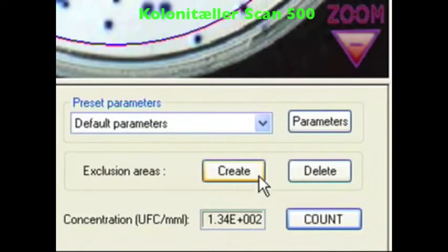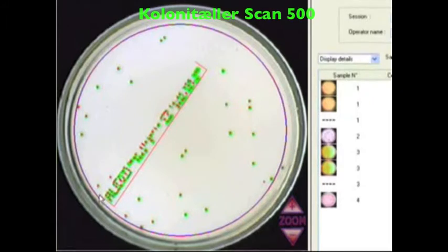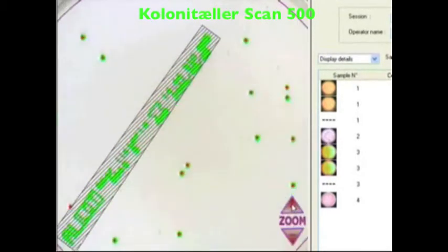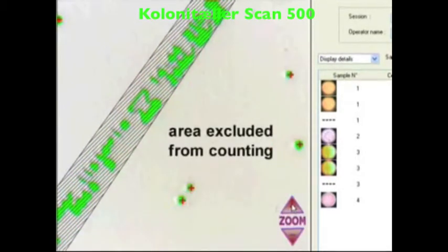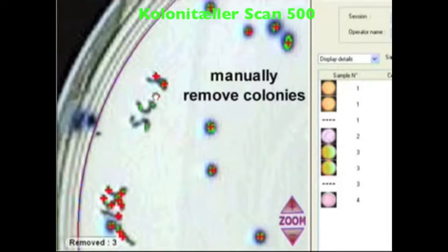Create your own exclusion areas to avoid unwanted counted elements. You can also manually remove or add colonies one by one.